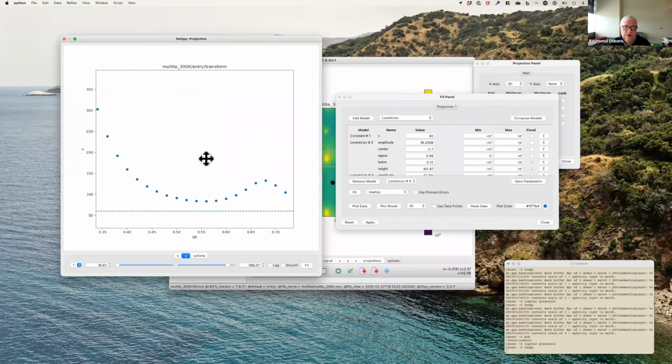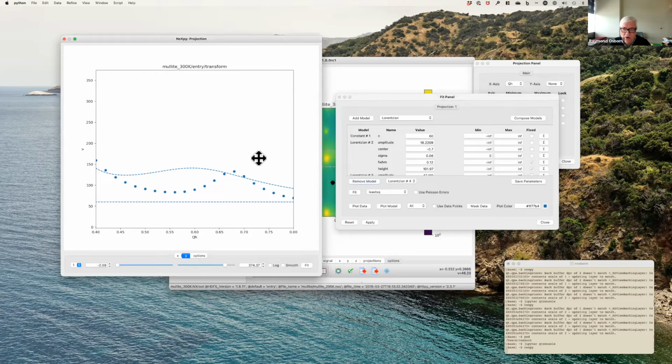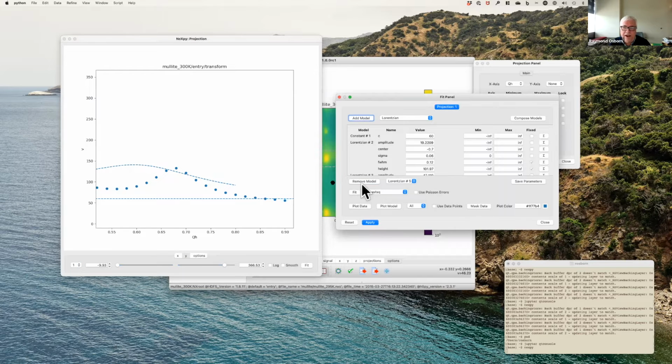And finally the fourth one. Okay, and then let's see what model. Actually, I don't know why it doesn't seem to get this fourth Lorentzian so well, but I might actually remove that Lorentzian and have another go. I think it's because I had too much of its tail. So I've now only got 4 Lorentzians. Let's go to here. Now let's add the Lorentzian and plot the model. Yeah, that's much better.